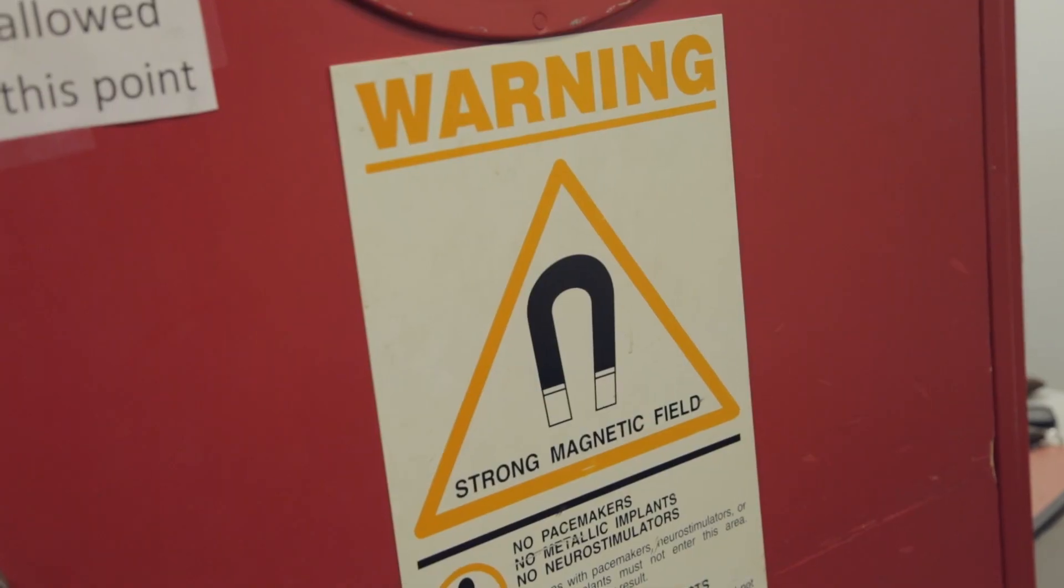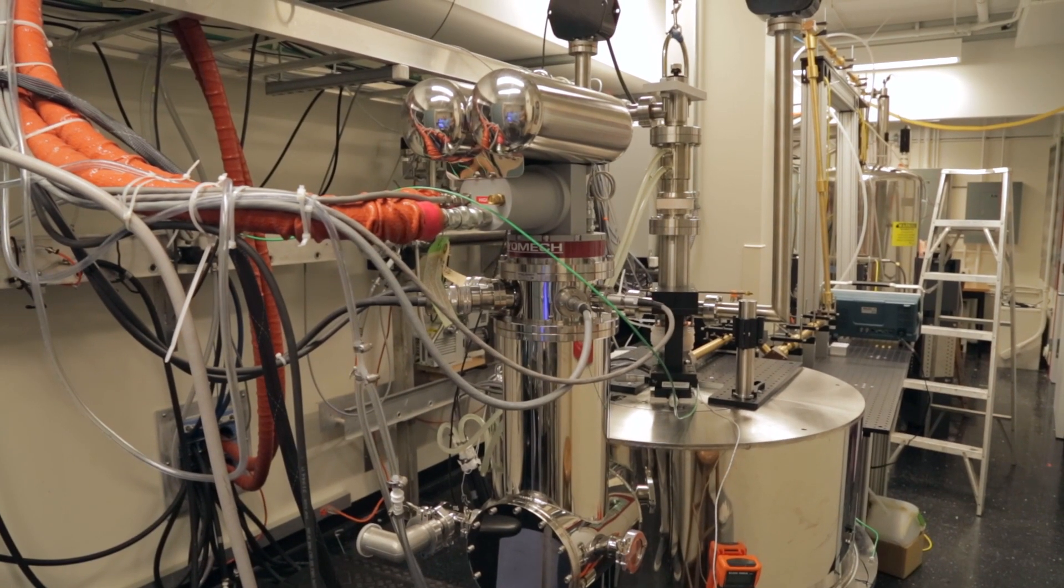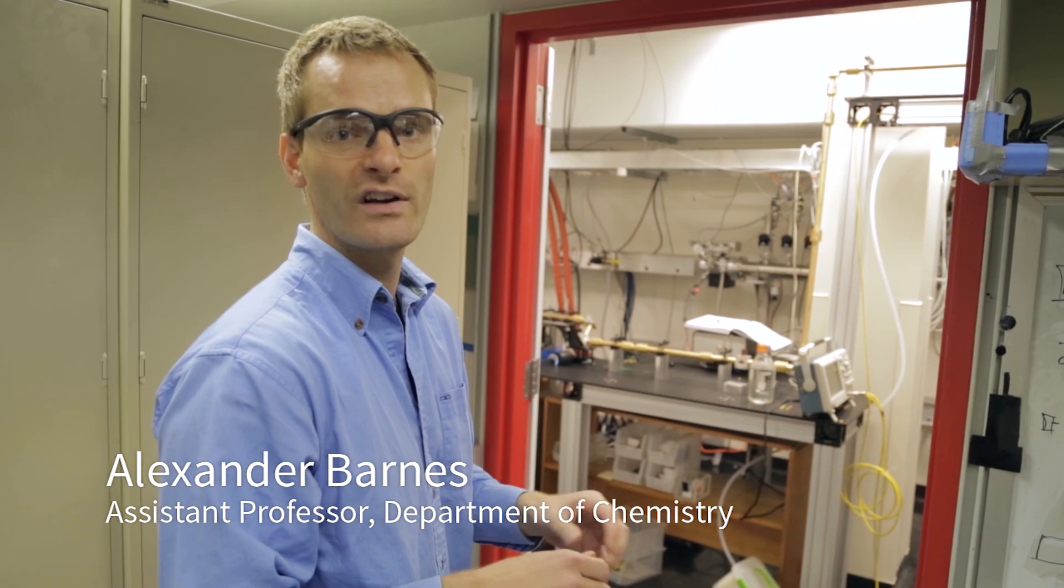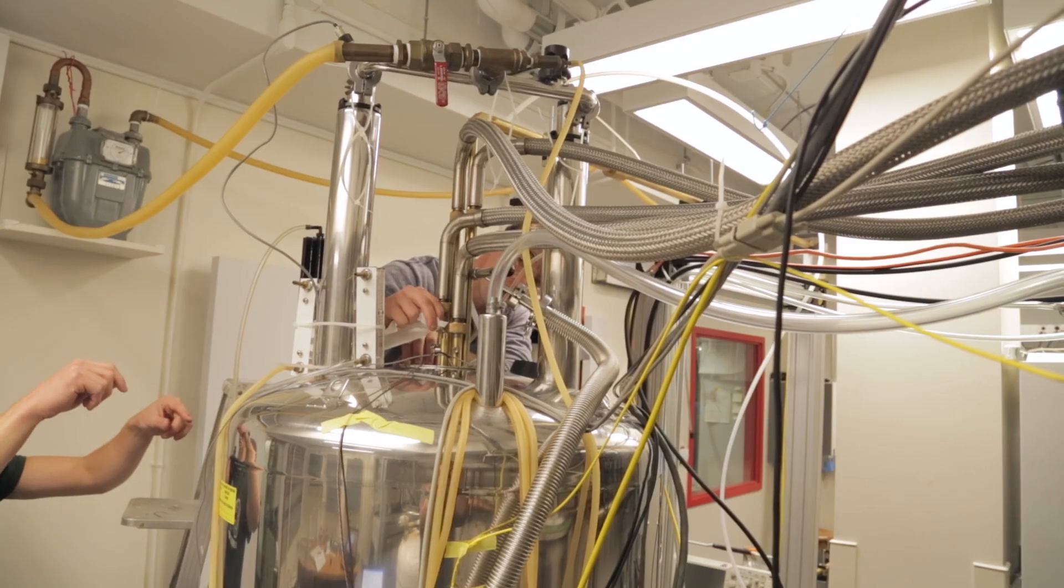So this is the first time we're turning on the DNP spectrometer. The gyrotron is now putting about 10 or 20 watts of power at 198 gigahertz. This is the first time that we're cooling the sample also.